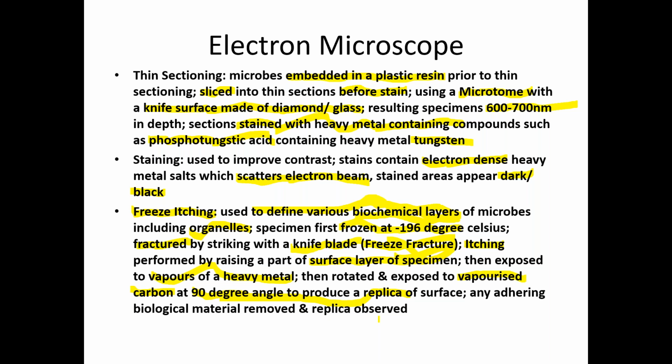Electron microscopes are only present in research institutions and virology labs, because it is a highly sophisticated and very costly piece of equipment. Only those organizations which can afford the cost will buy an electron microscope. Clear? So that's all about the specimen preparation for the electron microscope as well.